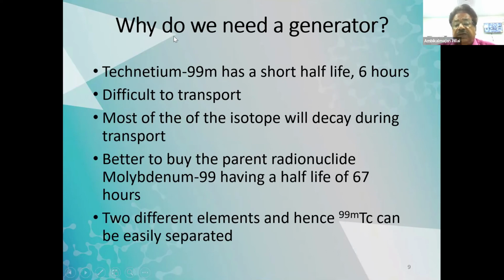Now, the question is, why do we need a generator? Can we not buy technetium-99m itself from the production centers? No, it is very difficult because it has a short half-life of only 6 hours.